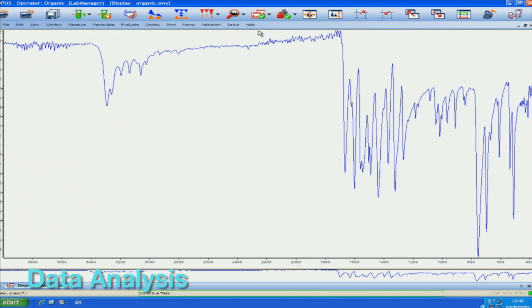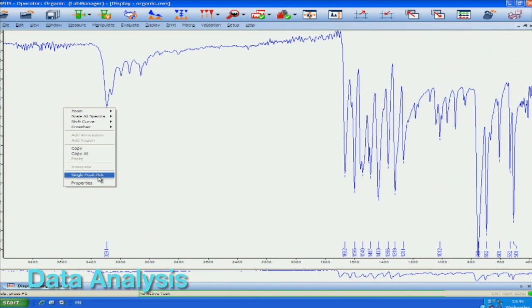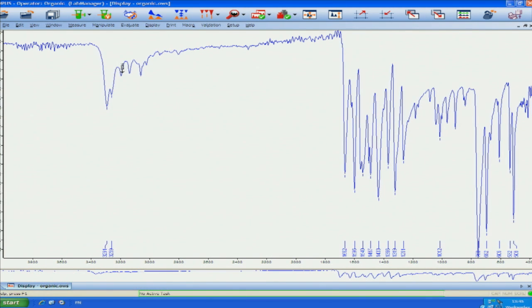Once your data has been generated, you will need to select the peaks of interest. Be careful of selecting too many peaks because it will give you a very cluttered spectrum.